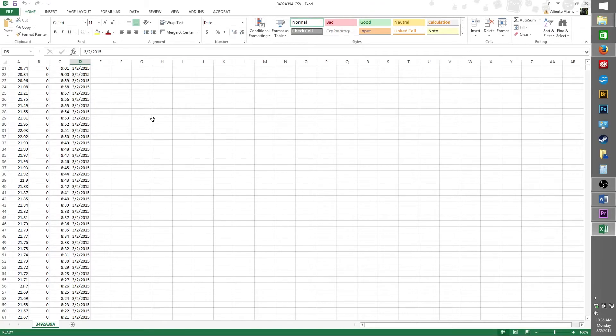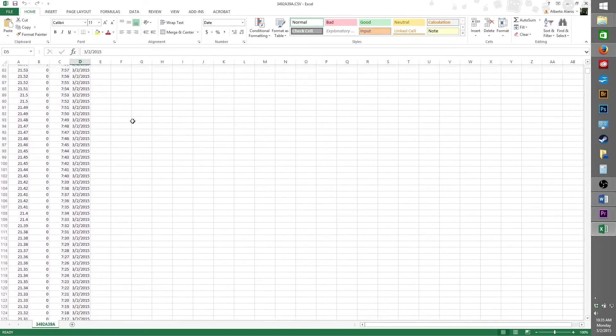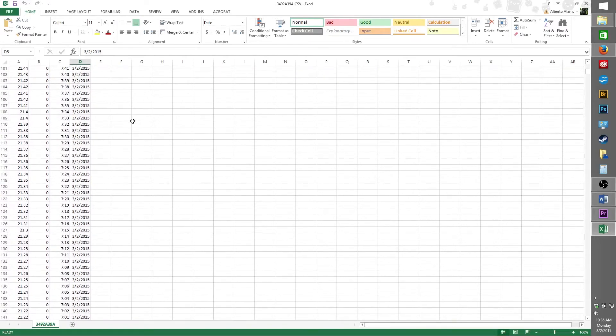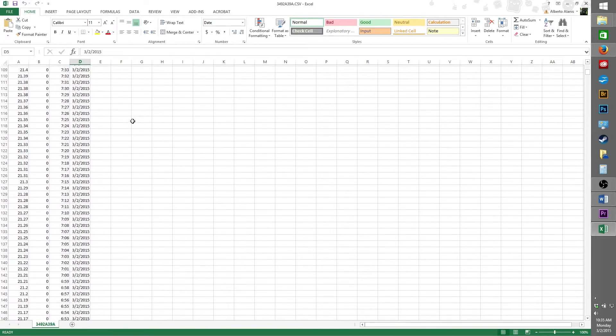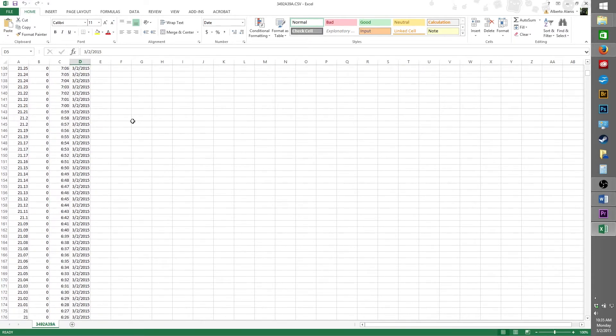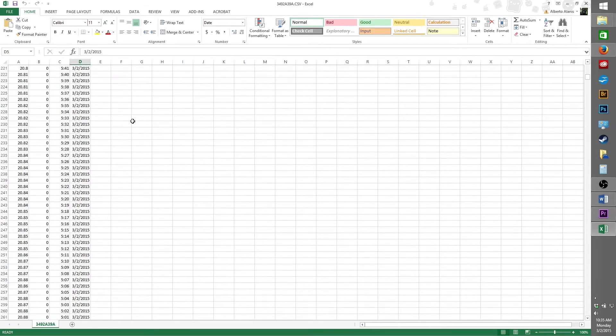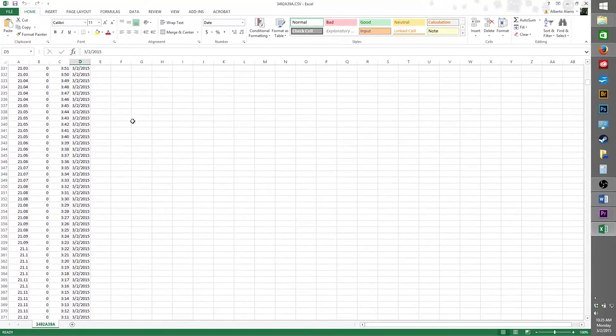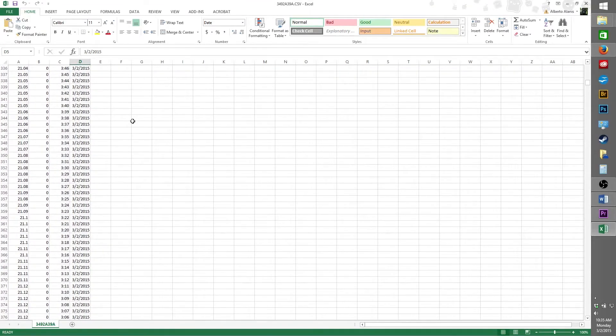As you begin to scroll down your spreadsheet, you may feel overwhelmed by the amount of data the traceable excursion track can observe and record. Not to worry, though. With Microsoft Excel, we can apply filters to your column so that you can only see the data you want to see. Let's go through two examples to get you reading your data efficiently and as quickly as possible.